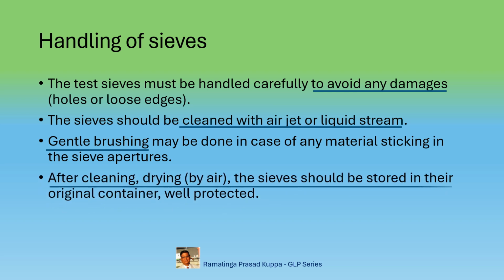After cleaning and drying by air, the sieves should be stored in their original container, well protected. This is important. As told earlier, the sieves are very sensitive equipment and should be treated carefully. After washing, the sieves should be placed firmly in a clean LDPE bag within the original box of that sieve.